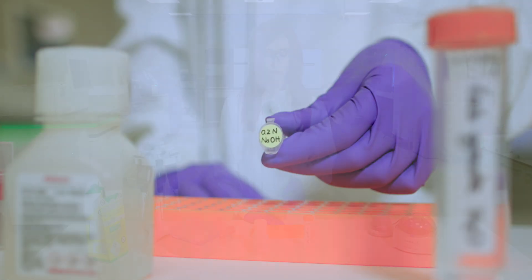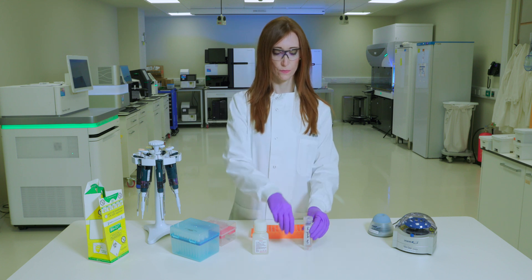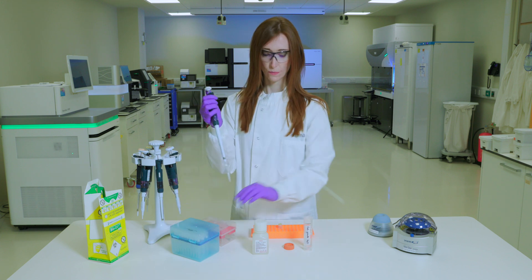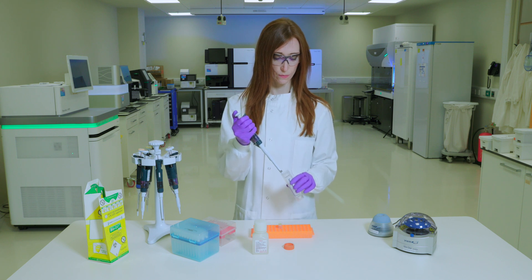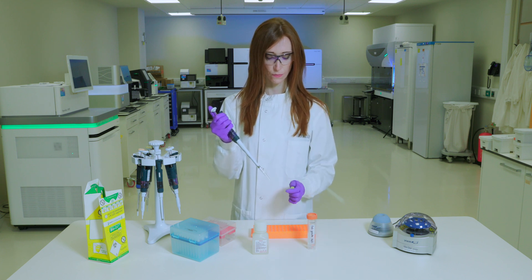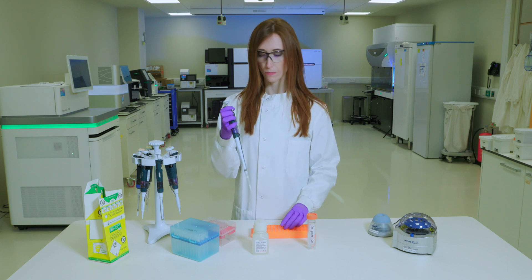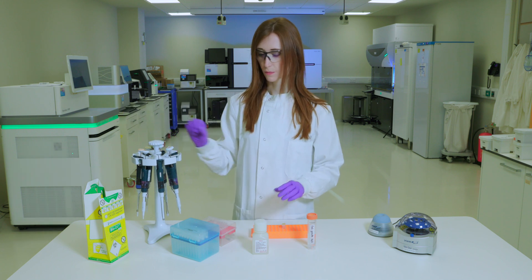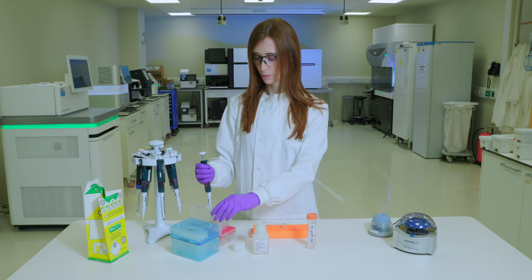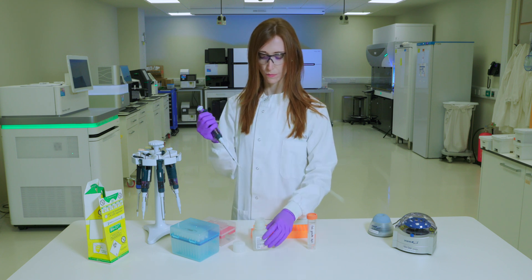To prepare a fresh dilution of 0.2 normal NaOH, take a 1.5 milliliter microcentrifuge tube and combine 800 microliters of laboratory grade water with 200 microliters of stock 1.0 normal NaOH.